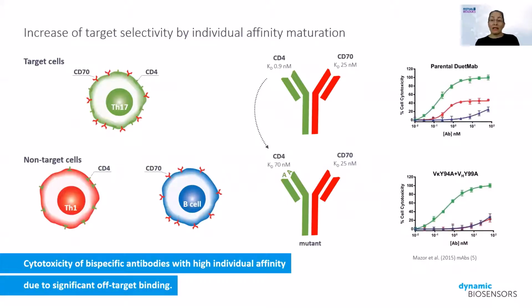The avidity of bispecific antibodies is gaining increasing importance with the development of new bispecific therapeutics. While many bispecifics are designed to connect two target cells, others are meant to bind to one target surface. The combination of two binding sites on one target surface is, for example, employed for increasing tissue specificity.